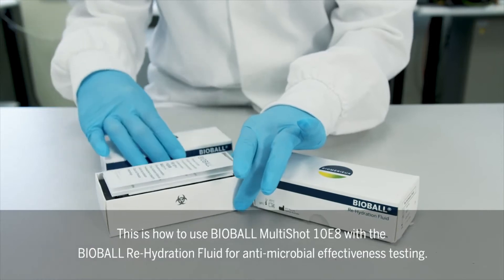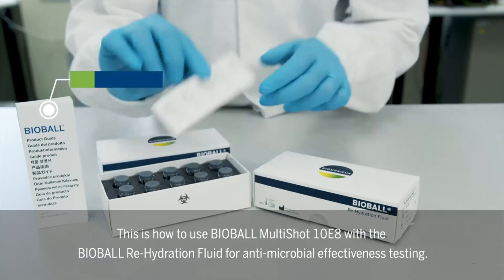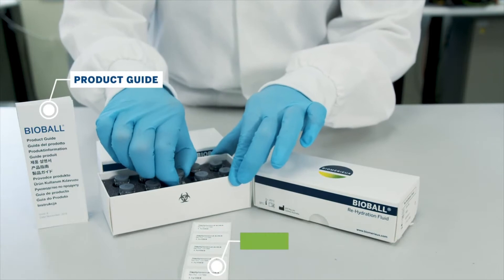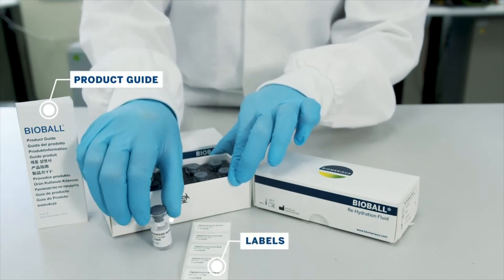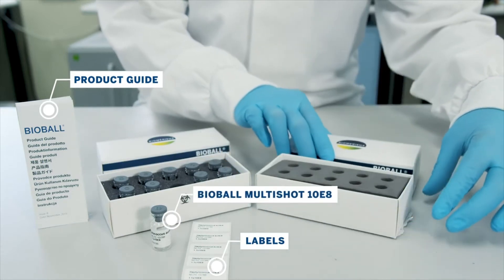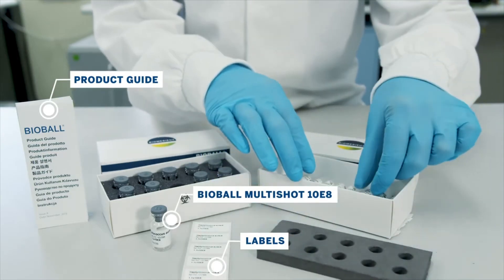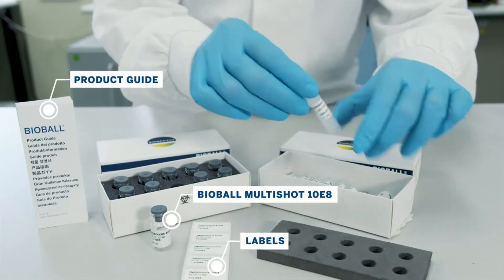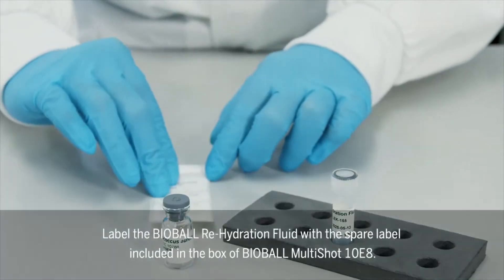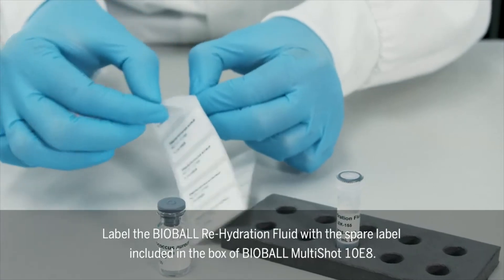This is how to use Bioball Multishot 10E8 with the Bioball Rehydration Fluid for antimicrobial effectiveness testing. Label the Bioball Rehydration Fluid with the spare label included in the box of Bioball Multishot 10E8.